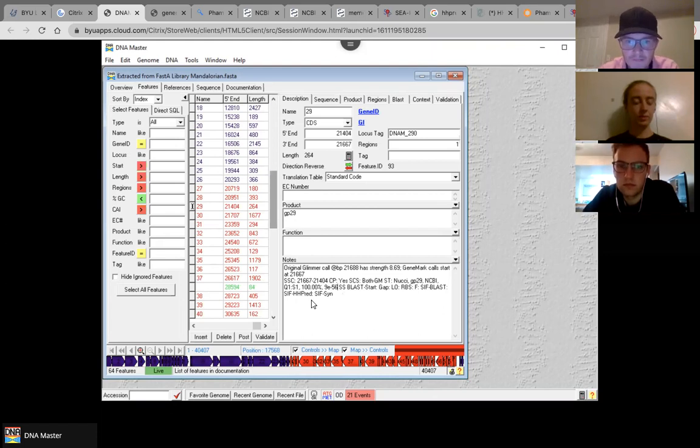And that is everything for the BLAST. And I just realized I put this all in the wrong spot. I put it after Starterator. So I'm going to copy and paste it real quick. Command X. That didn't work.